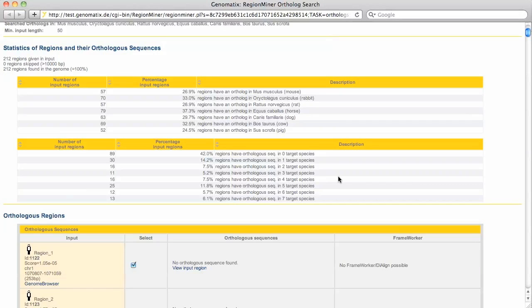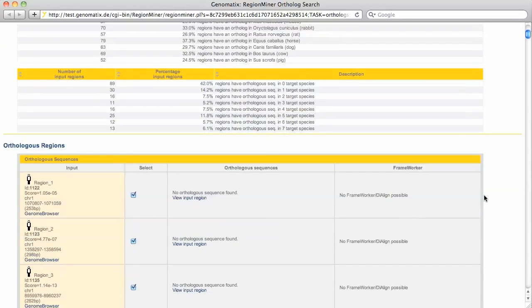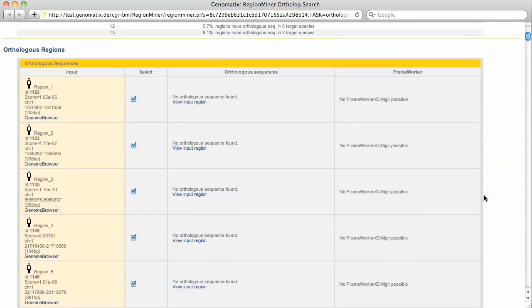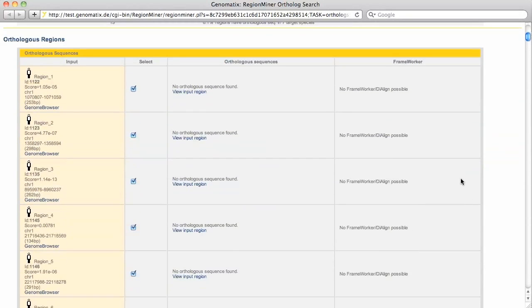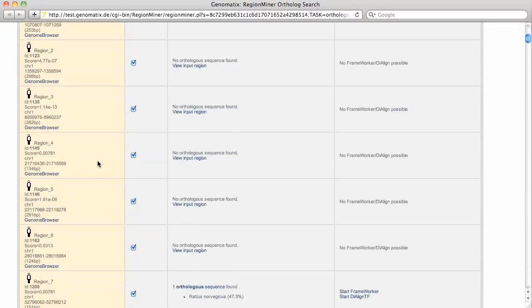Next, we get a list with all STAT binding regions with their orthologues. Not for every region an orthologue was found, but we can scroll down a bit here.